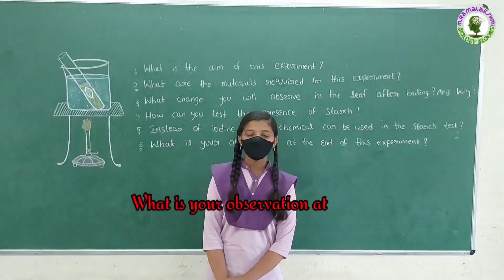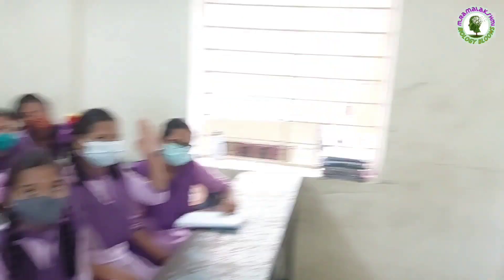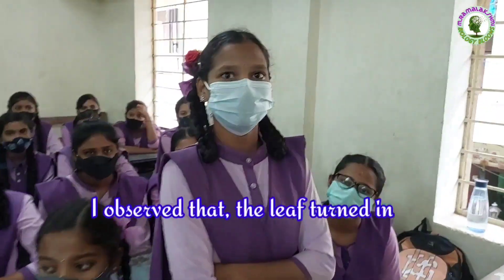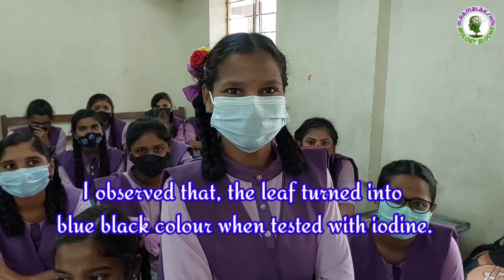What is your observation at the end of this experiment? Amrita: I observed that the leaf turned blue-black in color when tested with iodine.